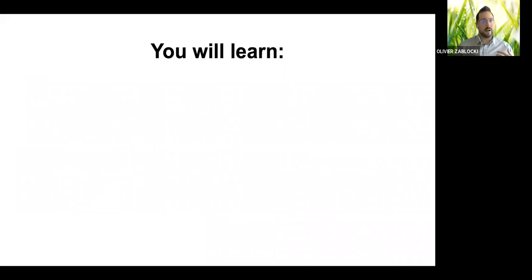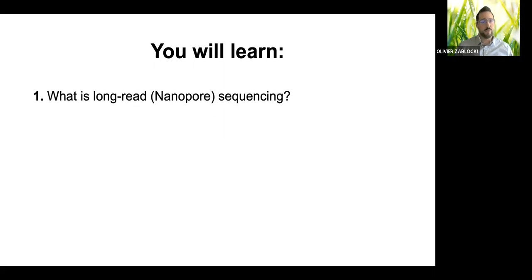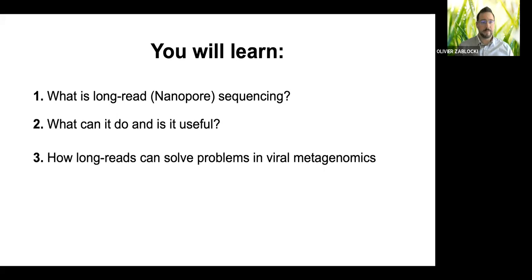Today I've got four objectives that I really want to teach you. First, what is long read, and specifically long read nanopore sequencing? There are several types of long read technologies. We will then go over its main features, what it can do, and how it can be useful for your research.